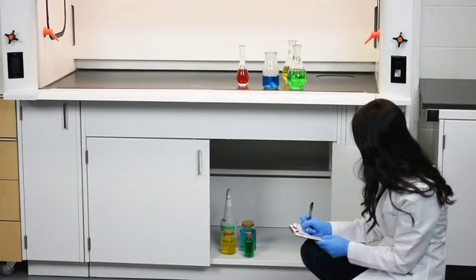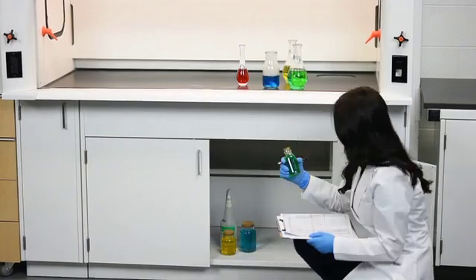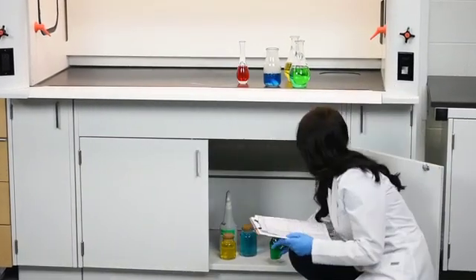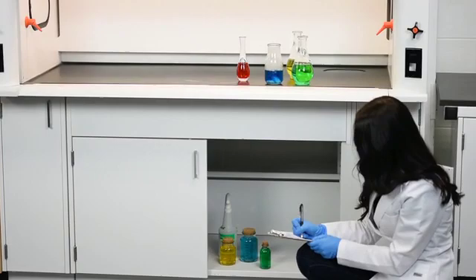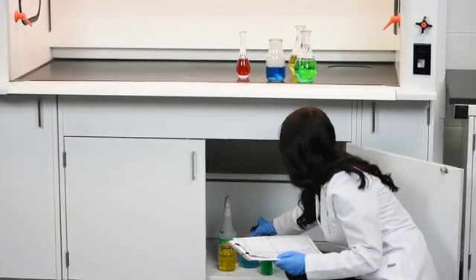It is also very important to keep track of all the chemicals stored under or near your fume hood. Make sure that all the caps are secure so that way spills and leaks are kept to a minimum.